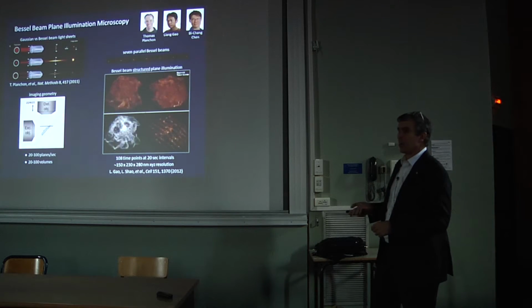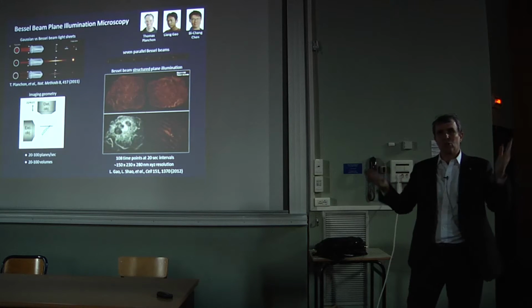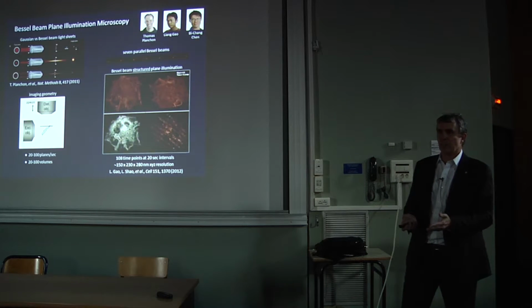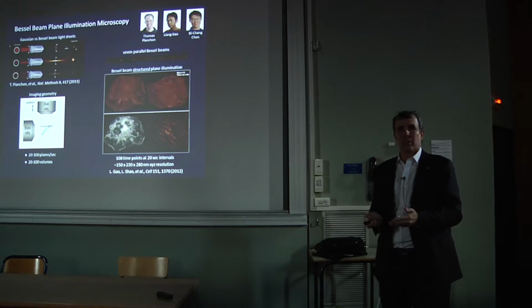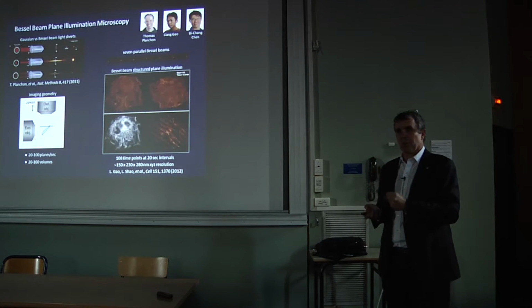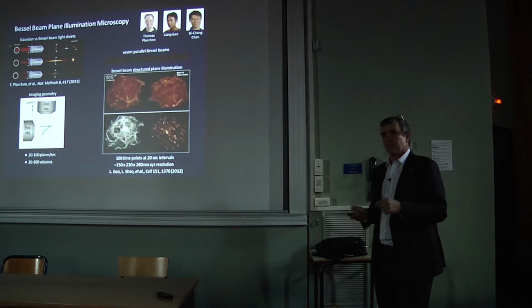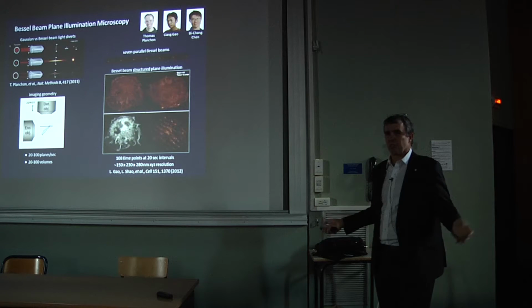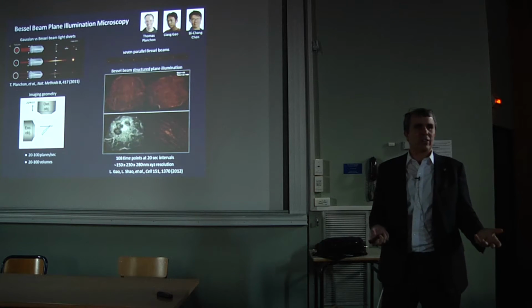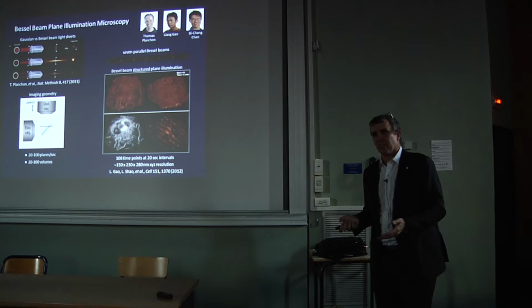And what I've learned now in doing about 8 years of live cell imaging is while the total photon dose you throw at your cell is an important metric, a far more important metric is the instantaneous power that you deliver to a cell. Seen in that light, the conventional confocal microscope, which is sort of the gold standard of live cell imaging, is probably the stupidest possible way to do live cell imaging.